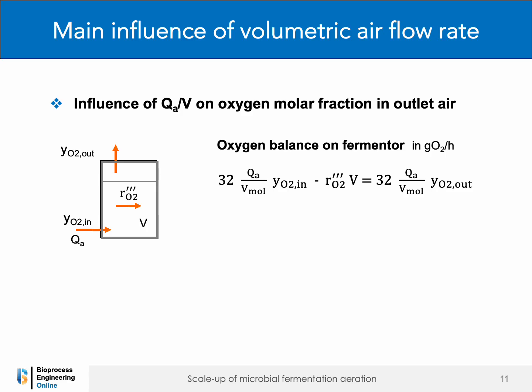In this balance, expressed in gram oxygen per minute or hour, the oxygen inlet rate is 32 Qa over V mol times YO2 in, where V mol is the air molar volume, 22.4 liters at 0 degrees Celsius and 1 atmosphere pressure.